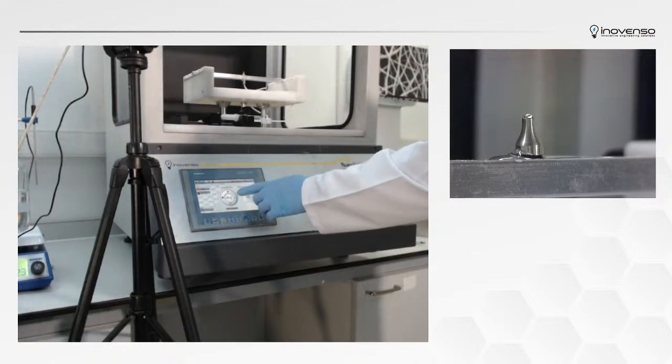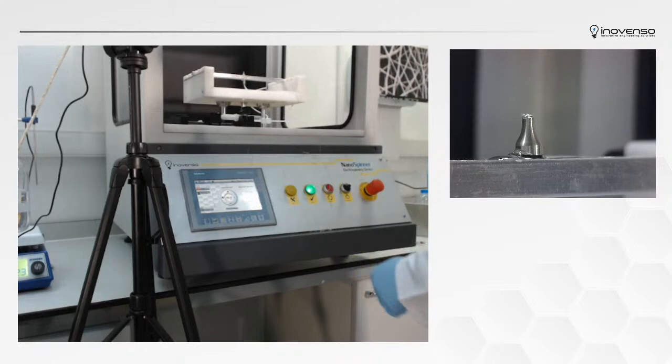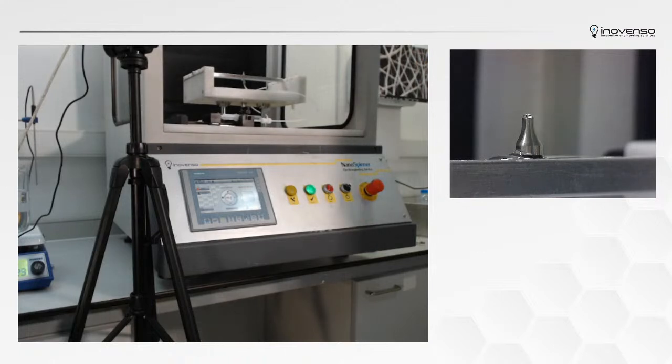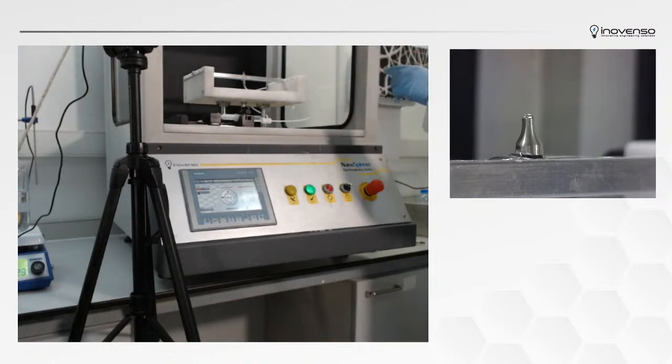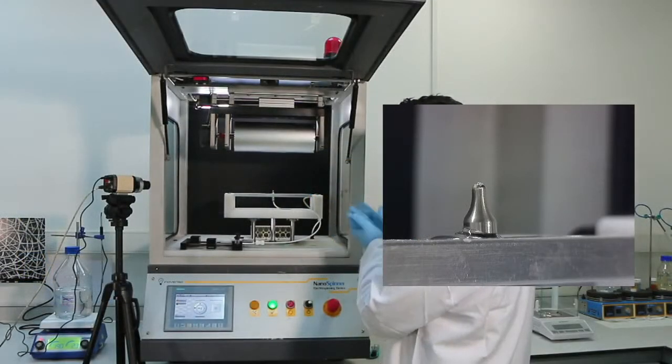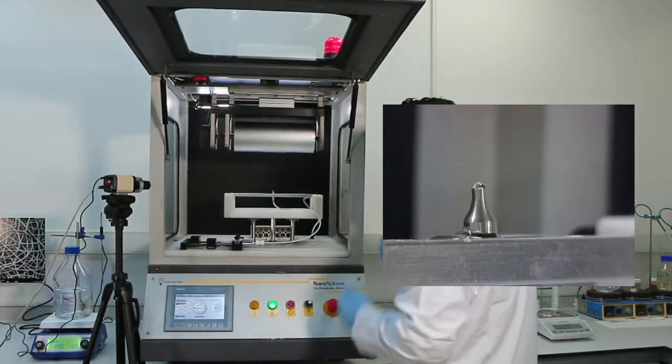It's going to be 40 kilovolts that we're going to put. Okay, now the process has begun. Right now I haven't activated the drum yet, but I will do so. But I want you to see the jets that are being formed. They're much more common, a multi-jet emission compared to the standard.